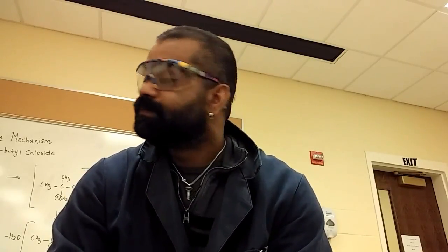Hi everyone. Today we're going to be making tertiary butyl chloride in our lab. T-butyl chloride, or tertiary butyl chloride, or 2-methyl-2-chloropropane, it all means the same. And we've already shown you a video on how to synthesize 1-bromobutane from 1-butanol. That was SN2.